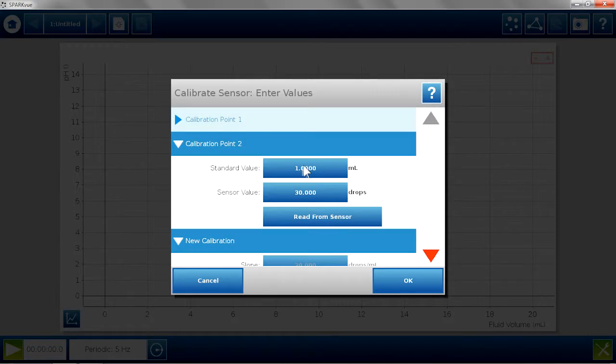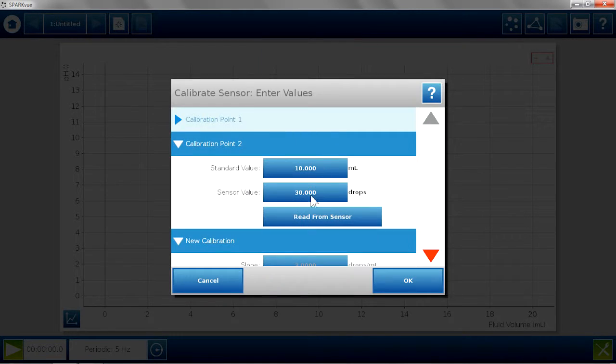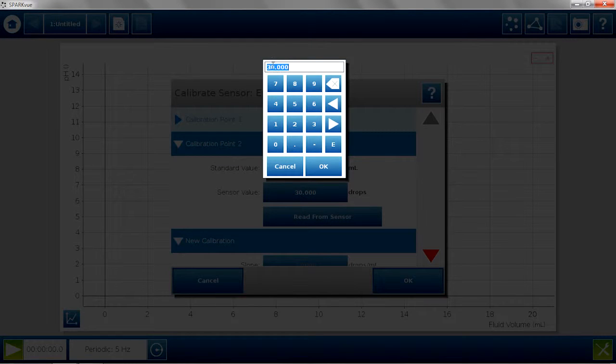I know that when I did this, there were in 10 mL of volume. The drop counter counted 327 drops, so I'm going to use that as my calibration.